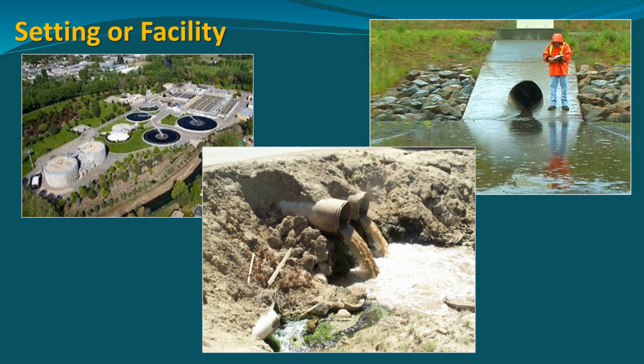It's still used for monitoring discharges, point source discharges, like end of the pipe kind of stuff from sewage treatment plants, industrial operations, oil refineries, things like that. But we use it a lot for agricultural monitoring. We work on a lot of agricultural programs at Granite Canyon. We do a lot of work with the Department of Pesticide Regulation. So we're always mucking around in sites like this that are systems that are receiving tailwater runoff from farms. And then stormwater monitoring, same situation.